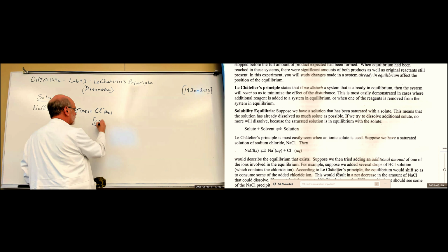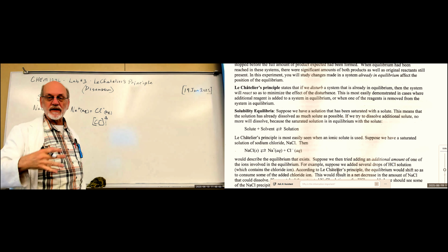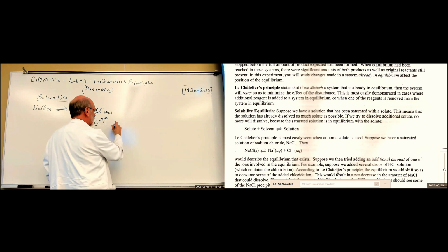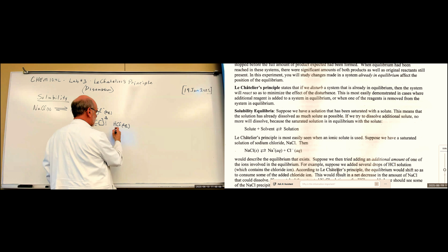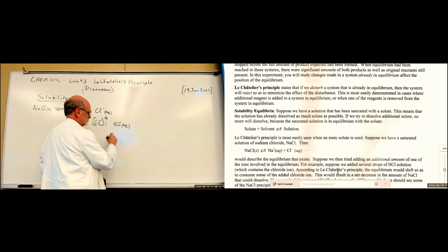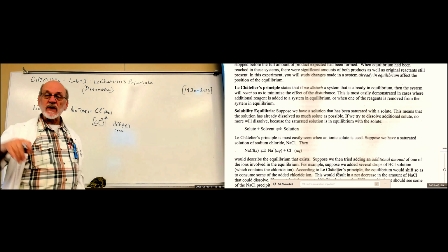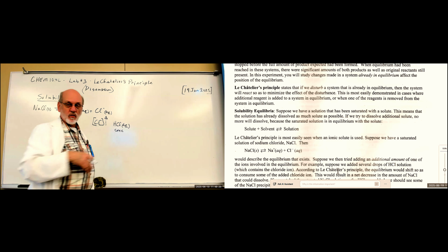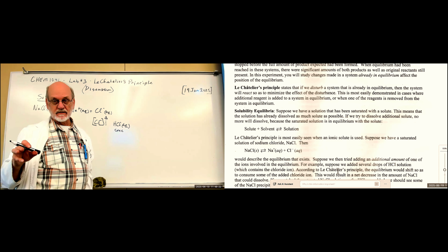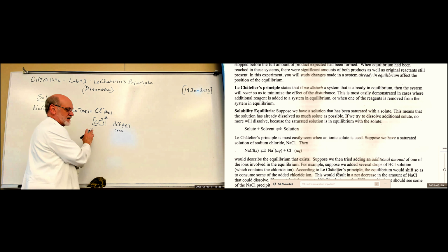So we're going to increase the concentration of chloride ions by adding hydrogen chloride or hydrochloric acid. And this is going to be, let's just say, concentrated. That is, when we add hydrogen chloride in this solution, we're not adding much water. That way, we can increase the concentration.